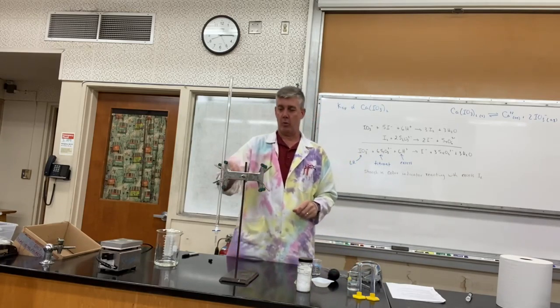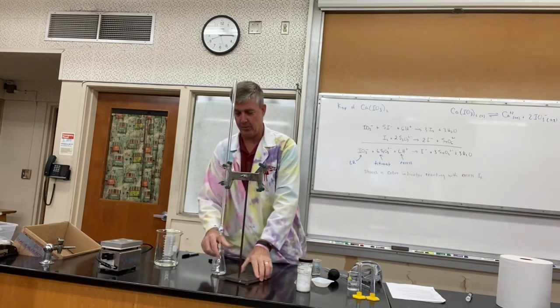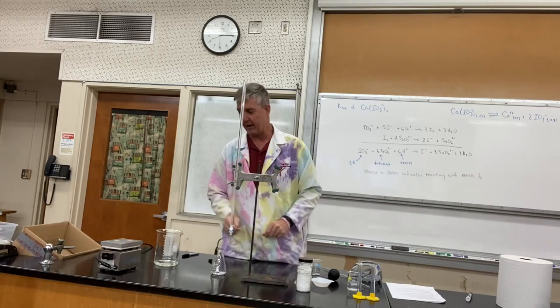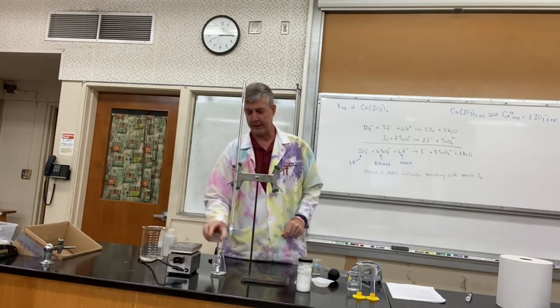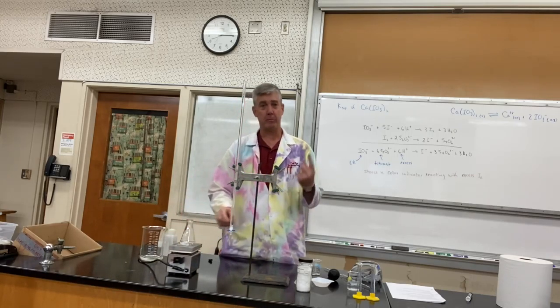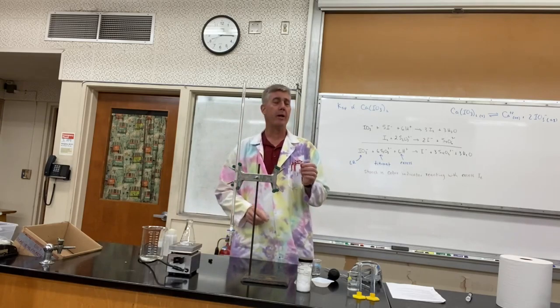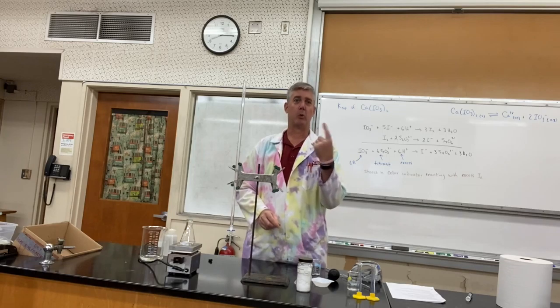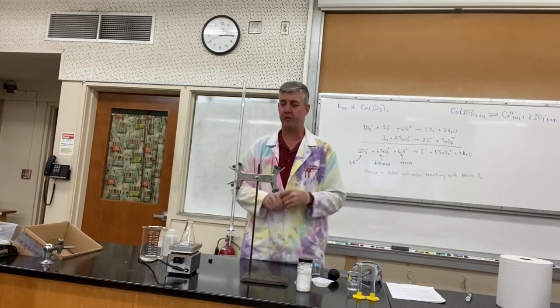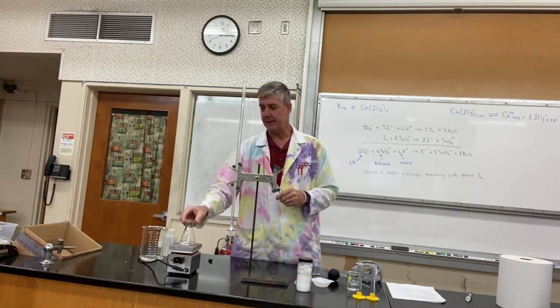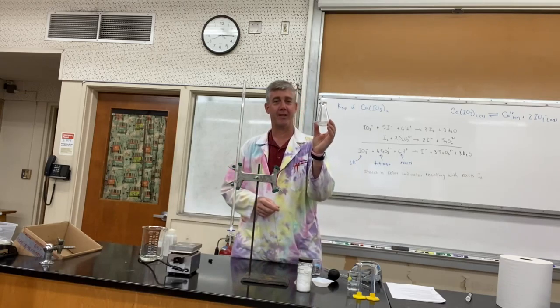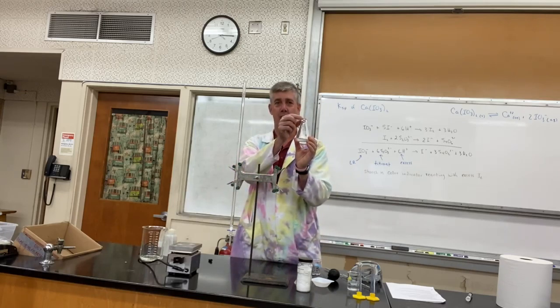The calcium iodate that we're going to be measuring, we want 10.00 mils. We want a lot of precision on that. So what we're going to do is use our 10 mil volumetric pipette. We've done that before, so we've got our pipette bulbs and our 10 mil pipette. We're going to pipette in 10 mils into our reaction flask.